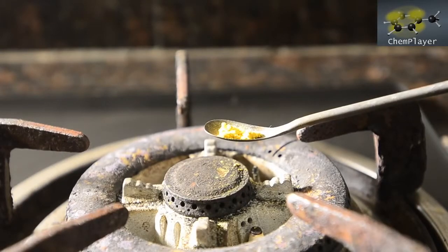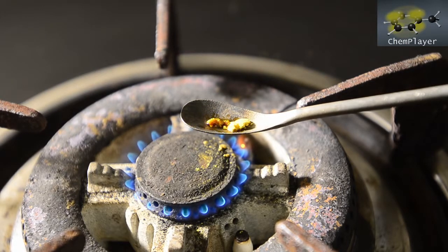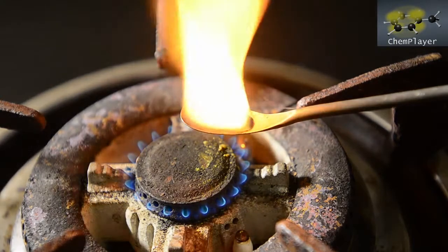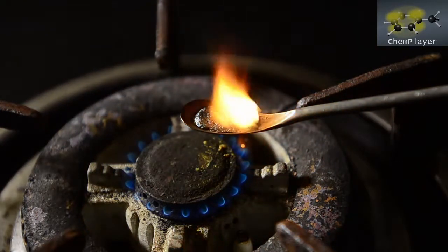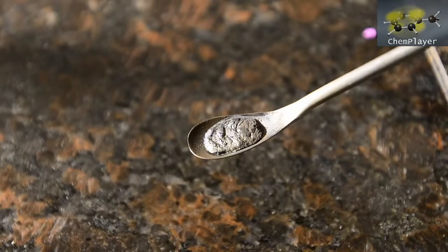First up, let's try to burn the sample. It melts at fairly high temperature, much higher than vanillin, and then burns quite vigorously, leaving a spongy mass of carbon behind. Okay, well that's interesting. Now we know it's not going to explode. Let's try something a bit more controlled.